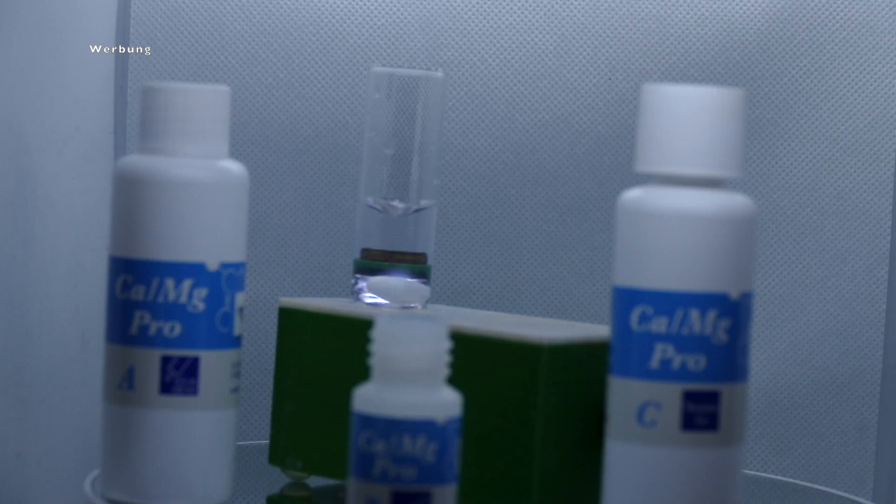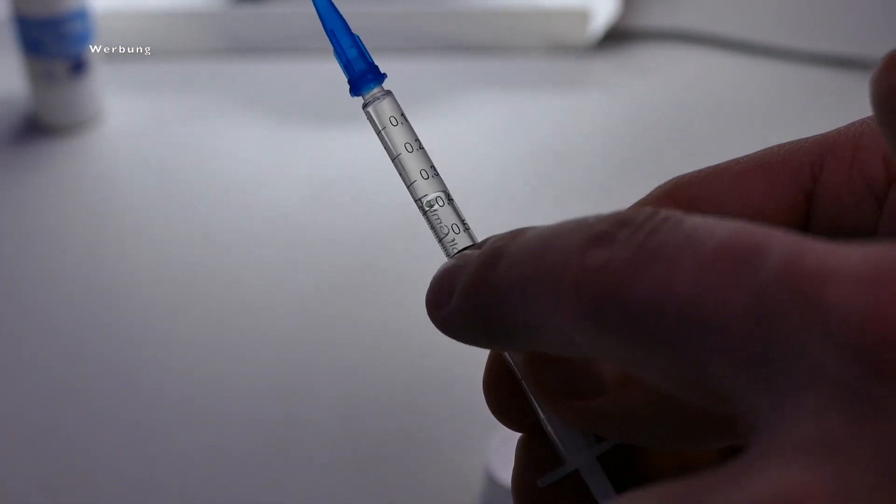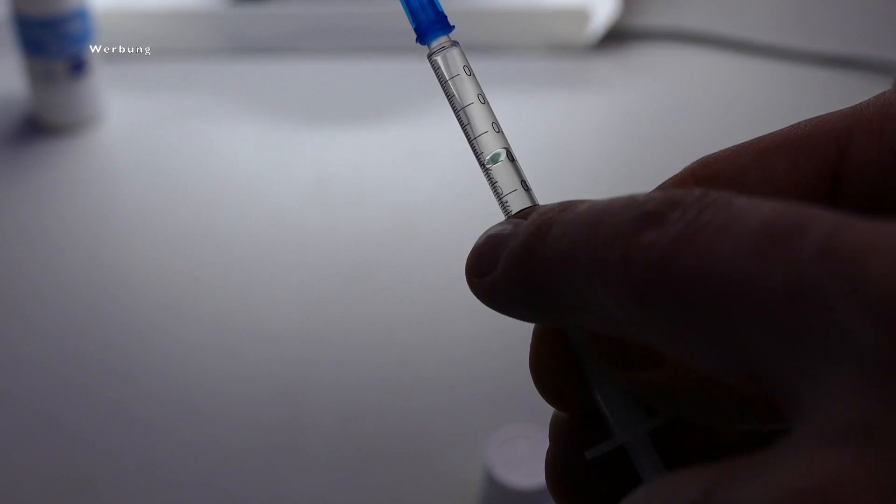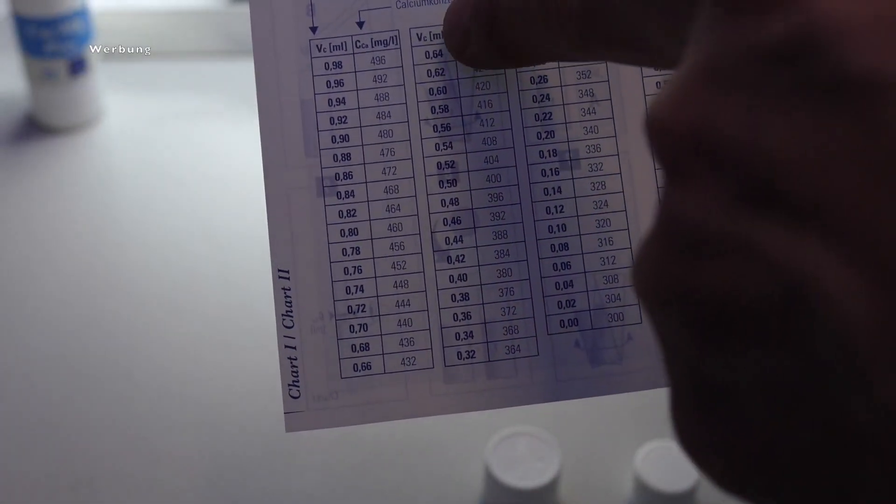You now have a remaining amount of reagent in your syringe, and you use that to read off your calcium concentration in this table, which you can see here. Okay, we have now determined our calcium value, but now we also want to know what magnesium value we have in the saltwater aquarium.